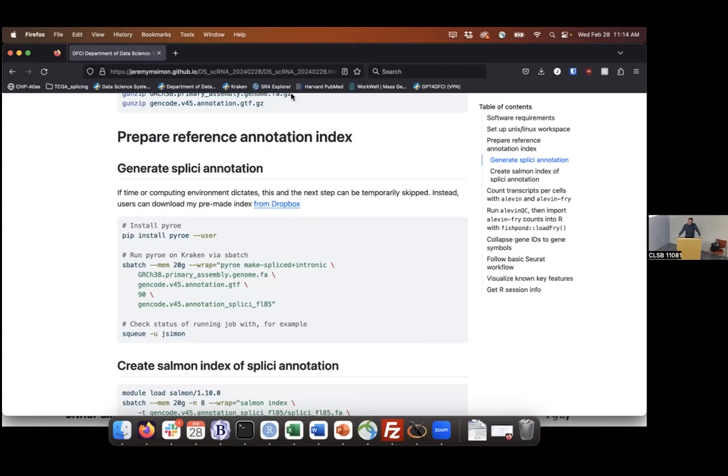Second question then is, not directly related, but how many amplification cycles do you do? What's the kind of limit of the UMI counts before deduping in a sample like this one? Is your question about how many cells could we get before our UMIs are no longer unique? No, I mean, I know the answer. But the question is how.